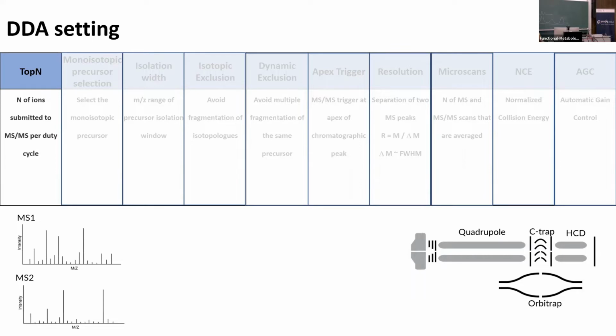And even worse, if you wait too long between the last MS-MS to be triggered and the precursor scan, and you have really sharp peaks, then the odds are that the molecule you observed during your precursor scan is already gone, right? So there needs to be a reasonable number of top N. This is really important. That's why I put it first here.